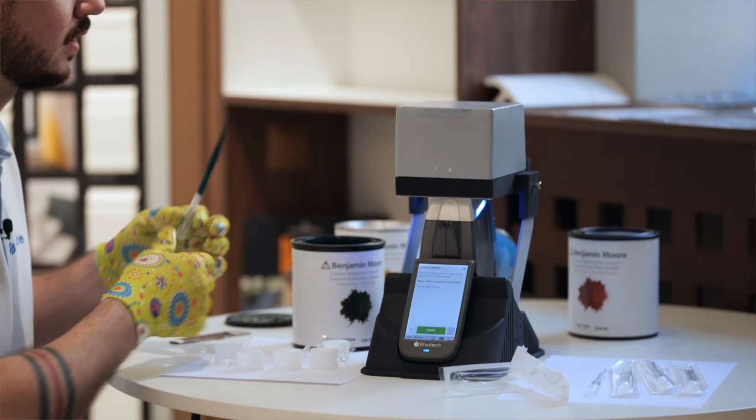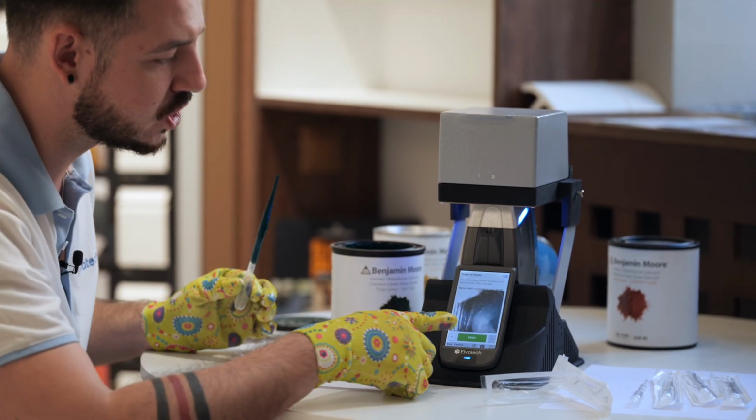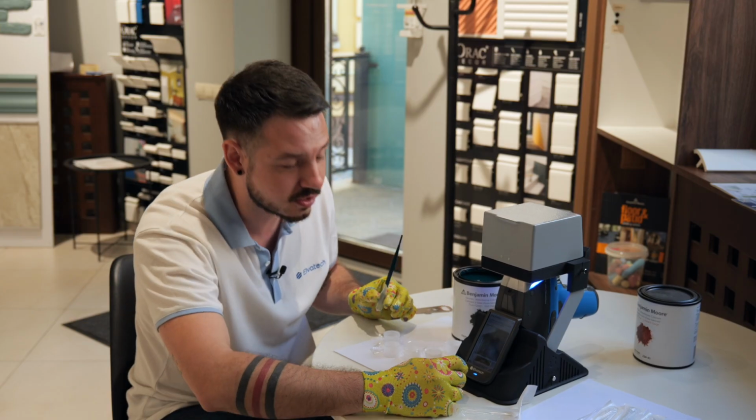Right, as we know that the sample is inside, it's positioned correctly. We also can check it out using the camera that's built into this device. And now we can start an analysis.